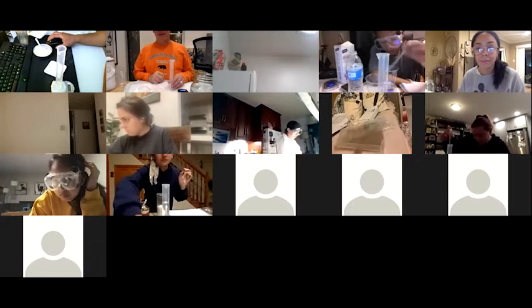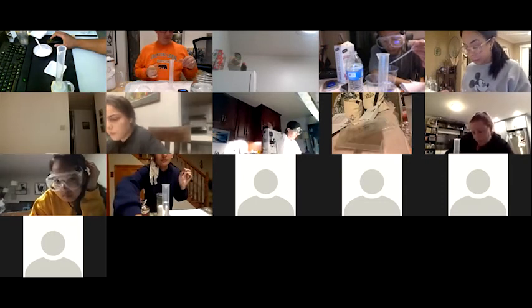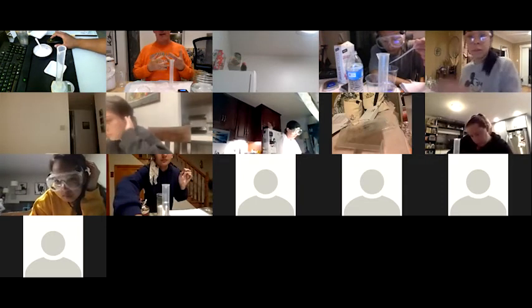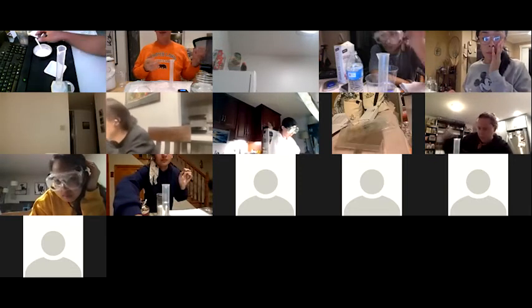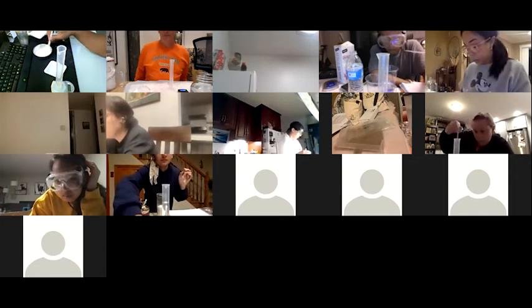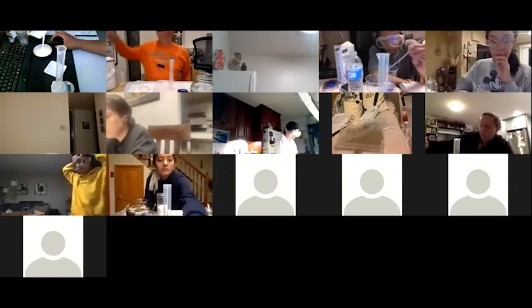So, you spilled? Yeah, that goes down as a source of error. Just make a note. Don't worry about it. These things happen. If it all dissolved before then, no harm, no foul. But if it hadn't, then there's going to be a little bit of error. Yeah, it has. Oh, then it shouldn't be a problem, unless you've spilled all of it, then that is a problem. No, it's like 5 drops.